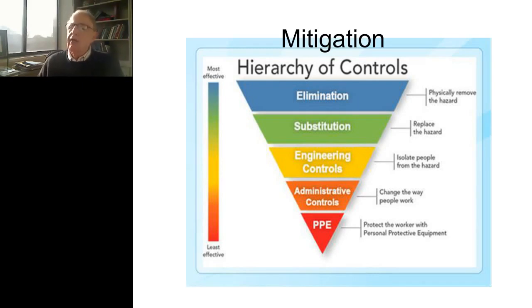And when you're thinking of the biosafety levels for a laboratory like BSL 1 through 4, that's essentially what's occurring with engineering controls. So when you're thinking of your mitigation strategies, one of the first things you want to think about is, is there a mitigation through an engineering control, or does it need to be an administrative control, or lastly, would a PPE be the most effective control?